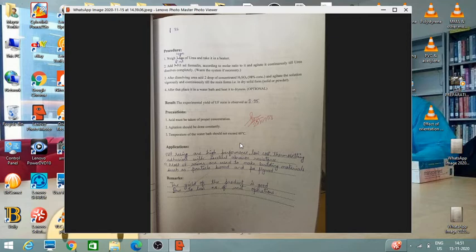So you know, formaldehyde can cause asthma and irritation to the eyes. That's why we cannot take it directly. Breathing the fumes of formaldehyde is also dangerous. Therefore, we have to take it in its diluted form, formalin.